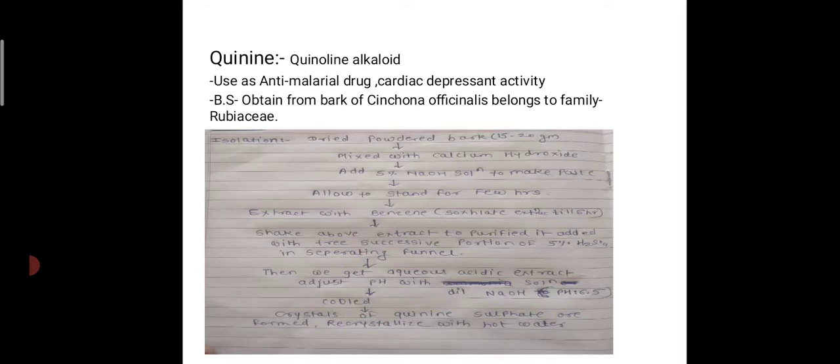As both are in powdered form, we add 5% NaOH solution to make a paste. Then it is allowed to stand for a few hours, and after standing it is extracted with benzene using the Soxhlet extraction process for 6 hours. Then after extraction, to purify the extract, we add 3 successive portions of 5% H2SO4 in a separating funnel to remove the impurities from the extract.